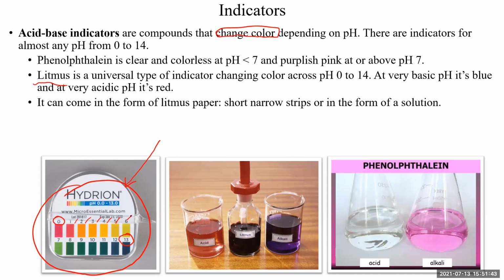So you dip, or use a glass stirring rod to put a drop of the solution whose pH you want to know onto your pH paper, and you look at the color. Sometimes you'll even put the strip of paper right up against the scale that comes with the pH paper and match the color to whatever you see. If it's yellowish, it's probably around pH 4. If it's bluish, it's usually a high pH around 11, 12, or 13.